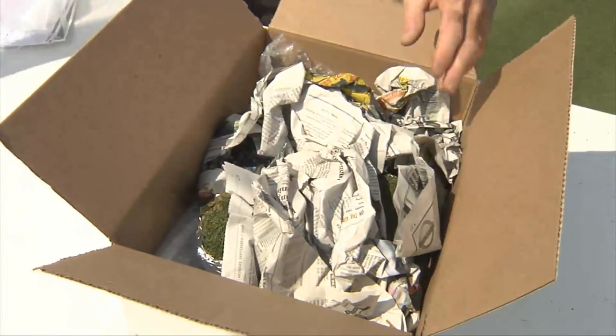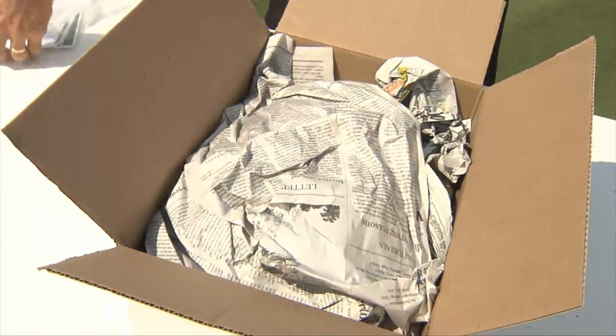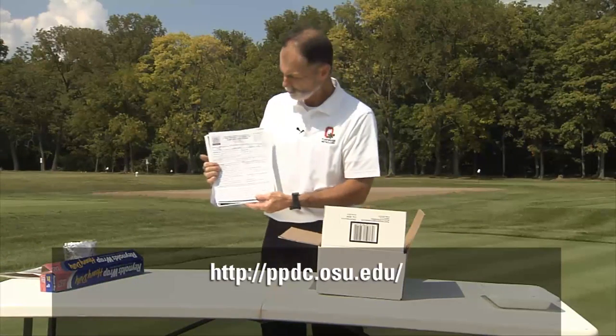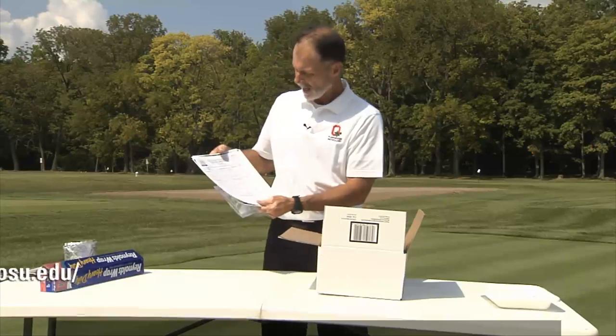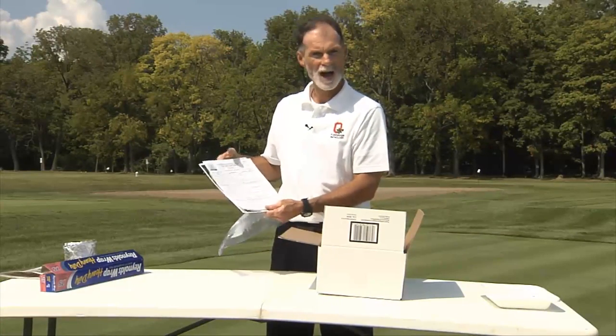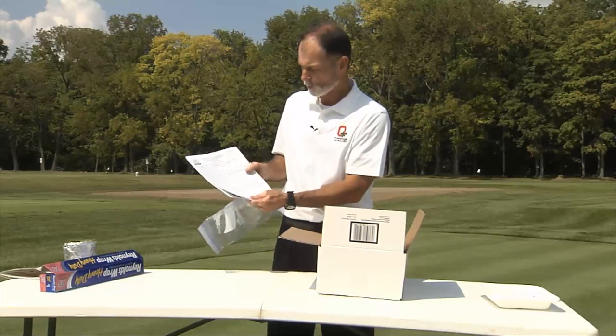Then before you seal the box make sure you fill out the diagnostic form which is available online at ppdc.osu.edu. Completely fill it out. Also many people are sending us photos which are very helpful — either hard copies or you can send an email file to us. We'll be happy to work with those.